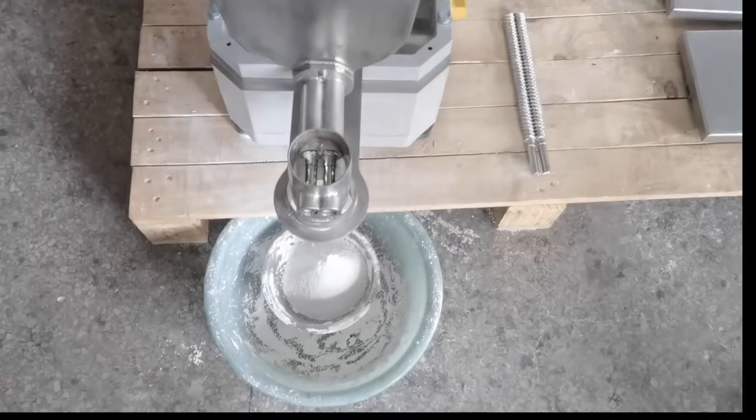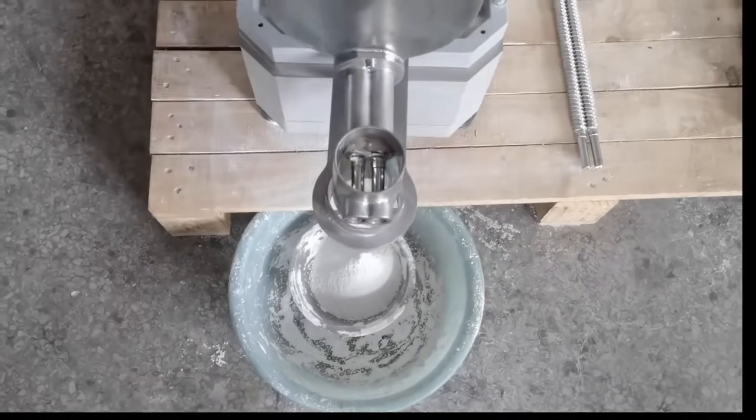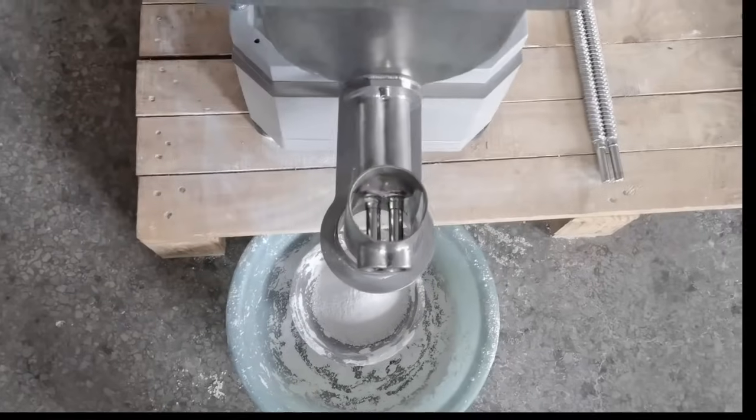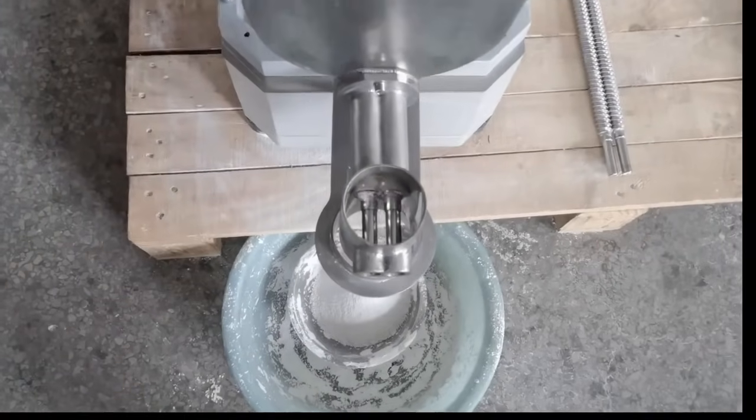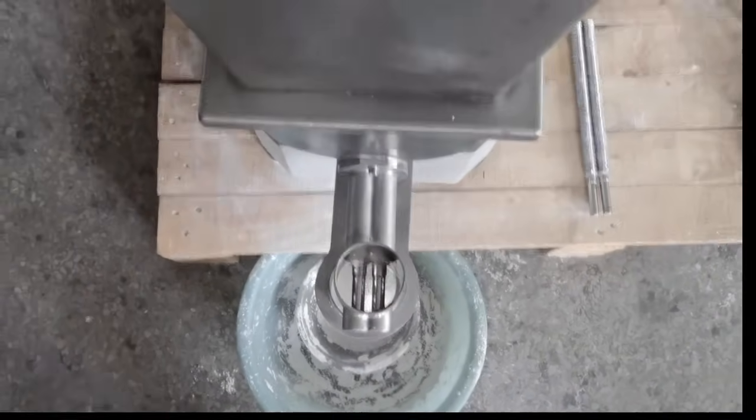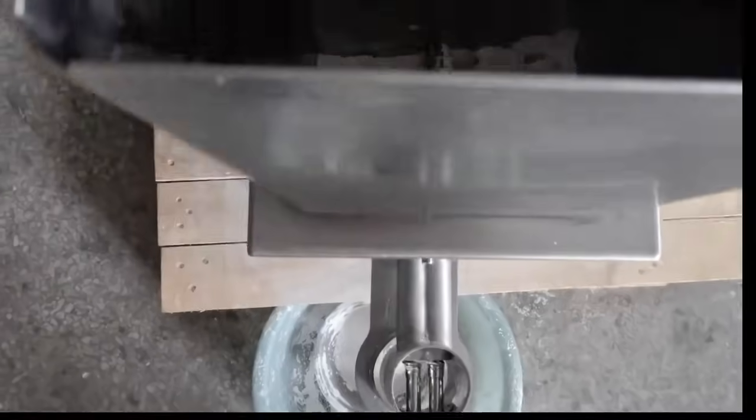Now we will show you the first feeder, pin screw feeder running. The material is calcium carbonate, it's powder.